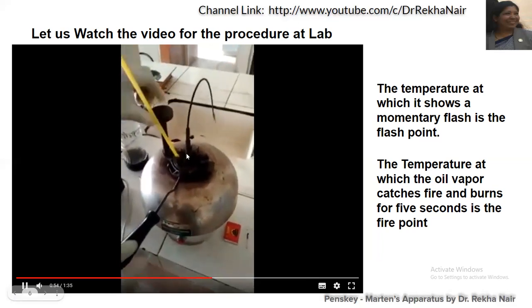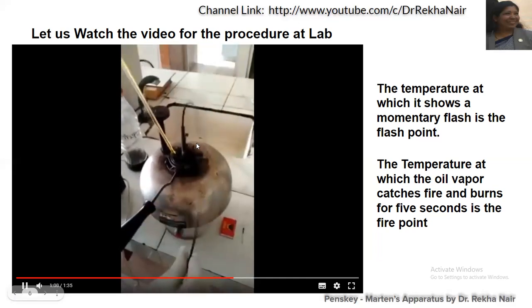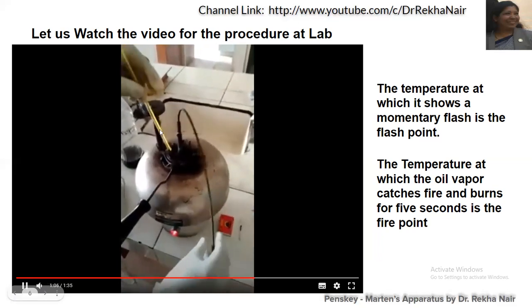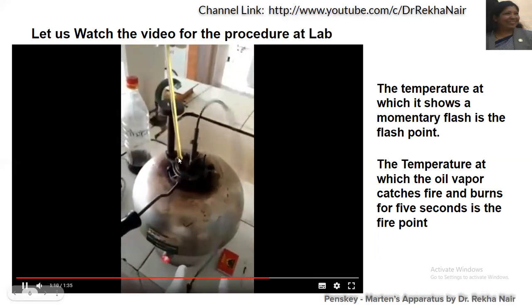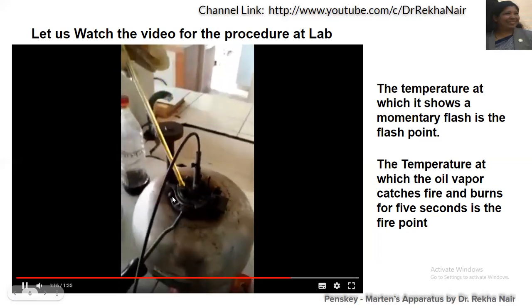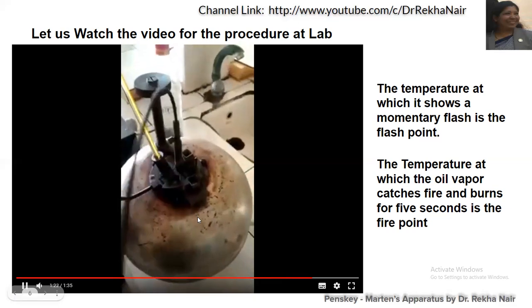The thermometer will be put in the oil cup so as to note the temperature of the oil. This is a liquid lubricant. Stirring will be continued and we watch the temperature rise. The temperature at which it gives a momentary flash is called the flashpoint, and the temperature at which the oil vapor catches fire and burns for five seconds is called the firepoint.